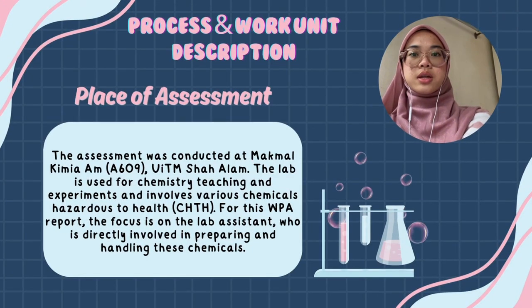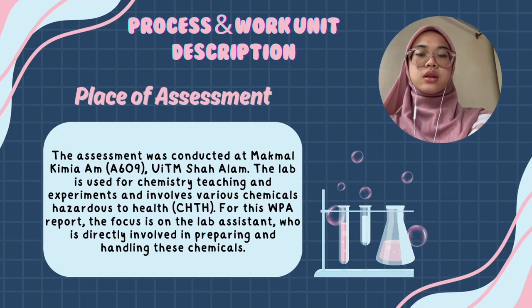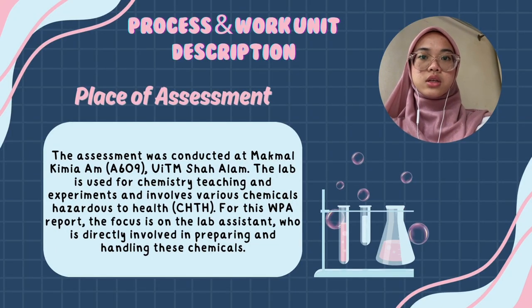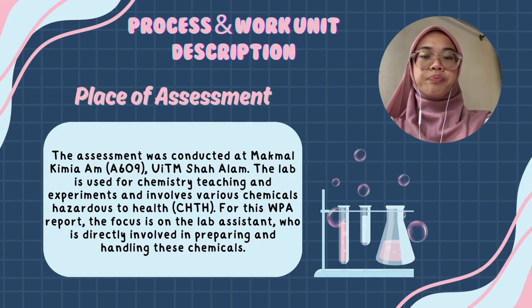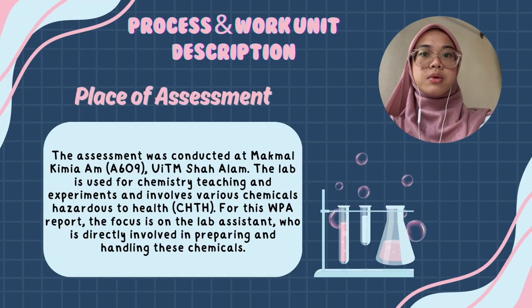Next, I will explain the process and work unit description. Our workplace assessment was conducted at Makmal Kimia Am A609 located at UiTM Shah Alam. This laboratory is used by students and lecturers for chemistry practical classes and research activities. Many chemicals hazardous to health (CHTH) are used in this laboratory. For this workplace assessment, we focus on the lab assistant because they are responsible for preparing and handling these chemicals before the experiment. Therefore, they have a higher risk of chemical exposure if the chemicals are not handled properly.